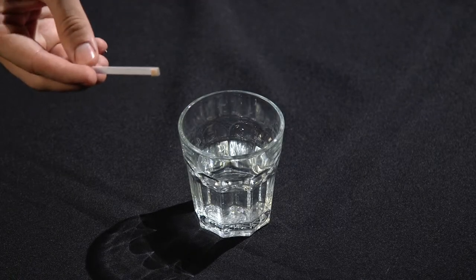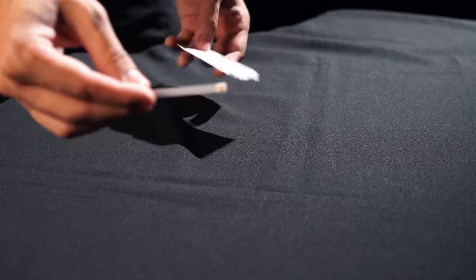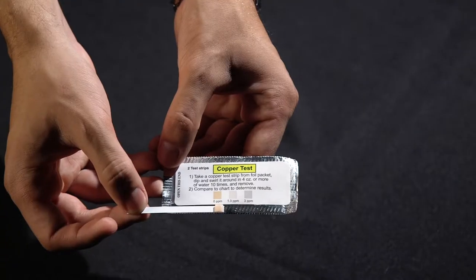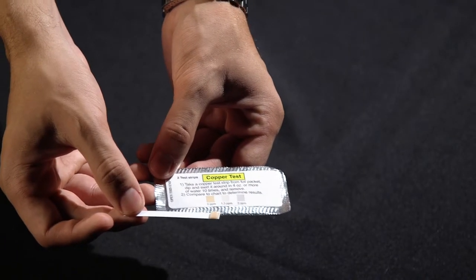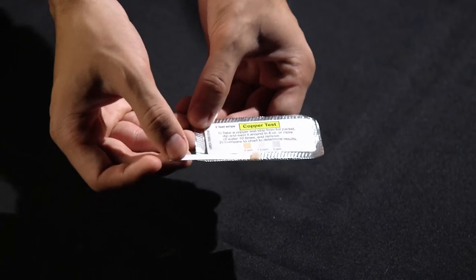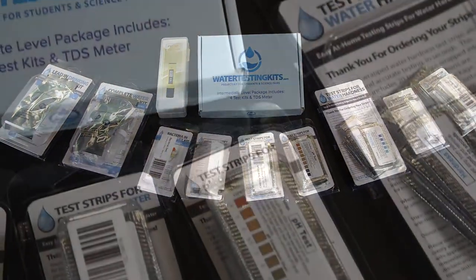Grab your test color chart and compare your test strip by holding it next to each section of the colored chart. That's it! Easy! Now you know your copper levels.